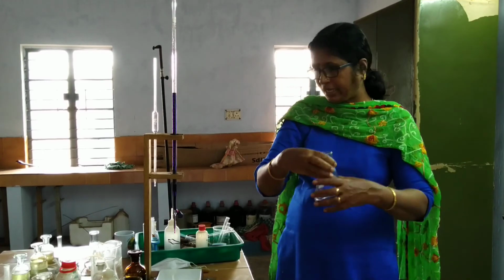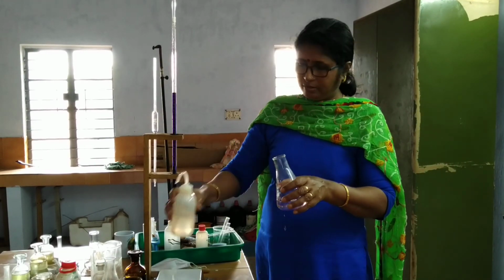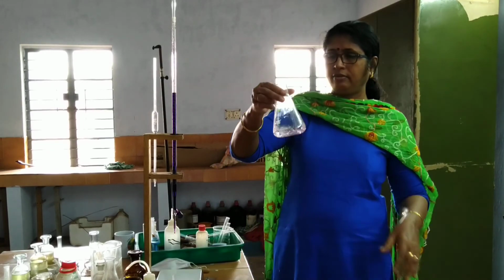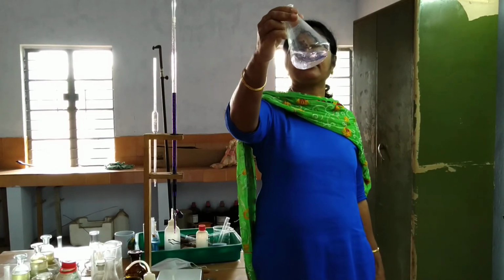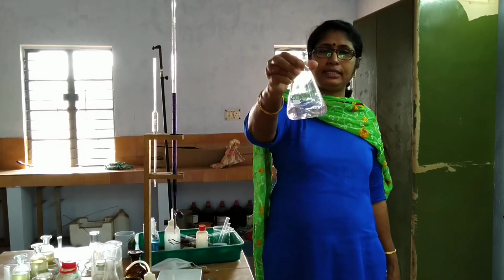You wait for some time, and you see one drop is here, put it to the side there and see whether you are getting a permanent pink color. Yes, the color is not going. That means the end point is reached.